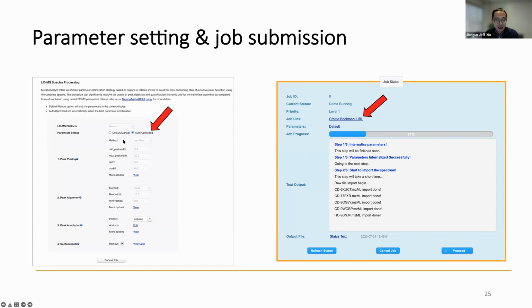Of course, you can also set parameters manually. We received a lot of requests asking why they don't get a result, and we realized their manual parameters were errors that we didn't even program to catch. Gradually we realized there were issues, so we now let users know these are errors and that they should readjust the parameters. The best way is actually to use auto, which will work most of the time, because it tries its best to find parameters that make sense.